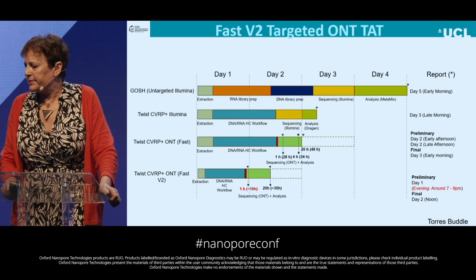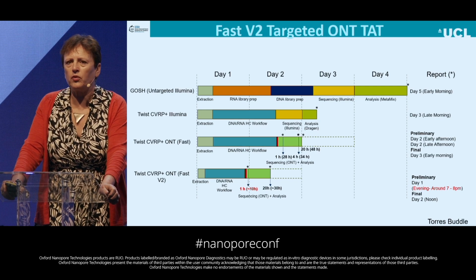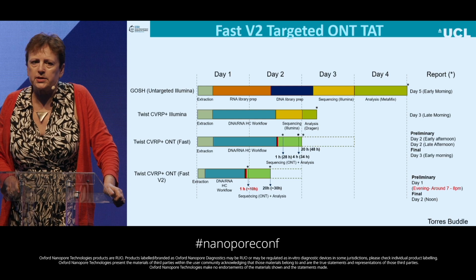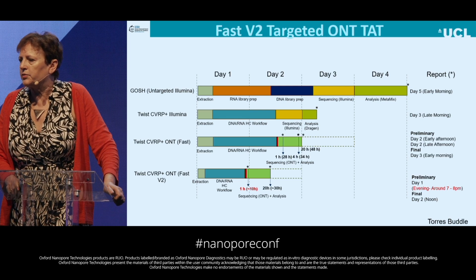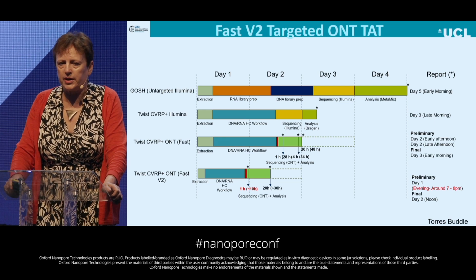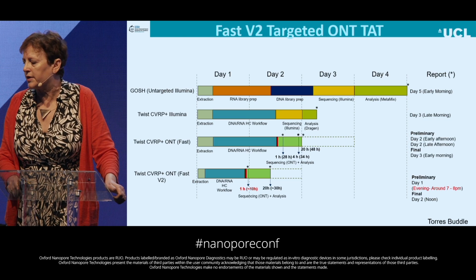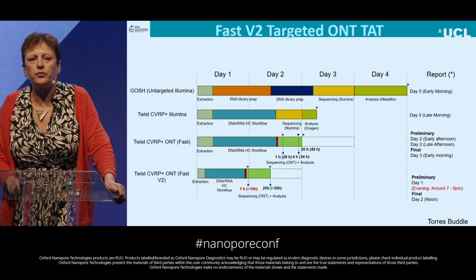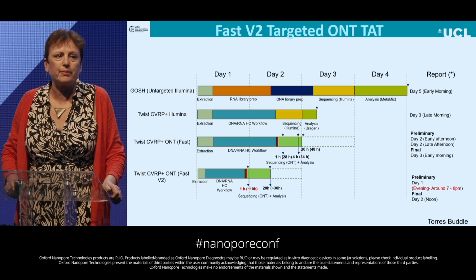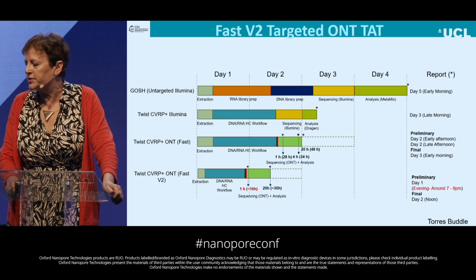So what does this mean in terms of how we can use this clinically? Well, we have also been working on trying to improve other aspects of the pipeline. And so what we've done is we've changed the extraction method, we've looked at the duration of hybridization, and we've done extensive analysis of whether we can reduce hybridization times. And indeed we can, and we don't have any worse outcomes. In fact, in some cases, particularly for RNA pathogens, bizarrely, the reduced hybridization times gives you a better sensitivity.